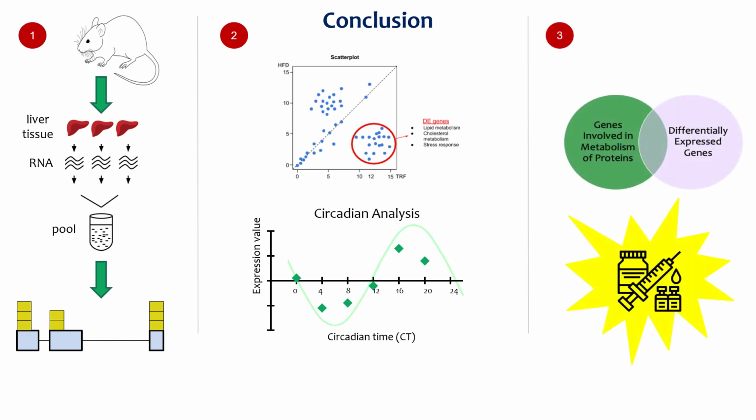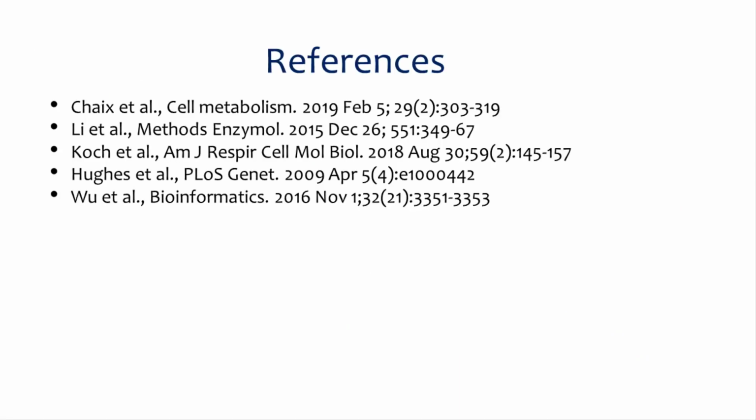Gene ontology analysis can then curate the repertoire of biological and physiological processes that are known to be regulated by the genes found in the RNAseq analysis and point to groups of genes that might be responsible for the observed phenotypes. Lastly, if little is known about the resulting gene set, investigators can generate new cell or animal models to study these genes or pursue them as possible drug targets to improve outcomes in disease.